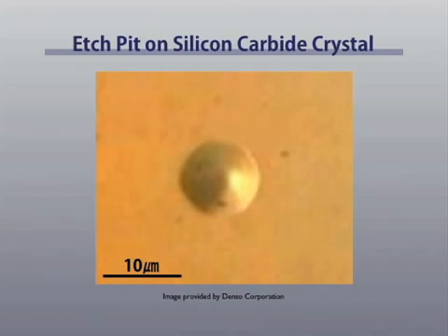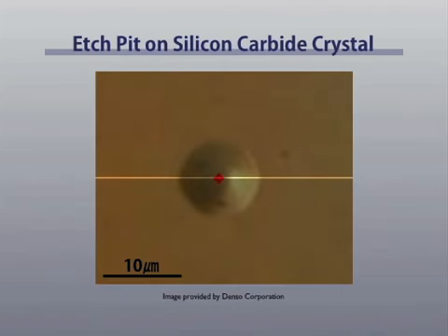An electron microscope is necessary to analyze the morphology and nature of the dislocation. The problem here is how to prepare a good specimen. A good specimen in this case means one containing the target dislocation. With conventional electron microscopes, the specimens must be as thin as 200 or 300 nanometers. You can easily imagine how difficult and tedious it is to enclose the dislocation into such thin specimen.